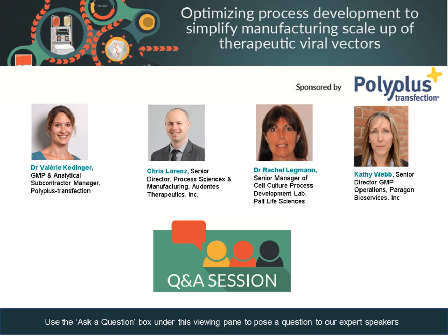But I think there are also additional parameters, as Rachel mentioned, such as the way you add the complexes at large scale. So you've got the complexation volume, which is much bigger, as Chris pointed out, and that's a recurrent issue. Then there's the incubation time of the complexes, because you need to take into account the time you need to prepare the complexes and then for the complexes to reach the cells in the bioreactor. All of these parameters, which I touched upon earlier during the presentation, are key considerations, which at small scale can be considered minor, but when you go up to large scale, they become a lot more important.